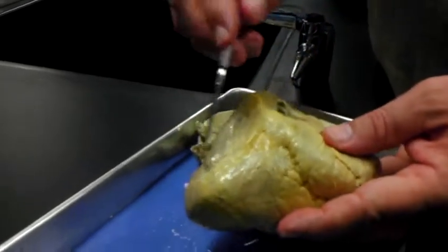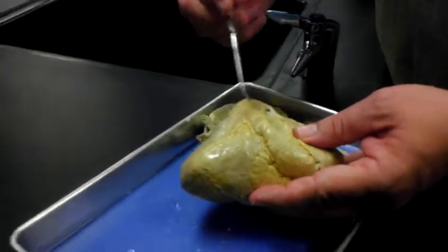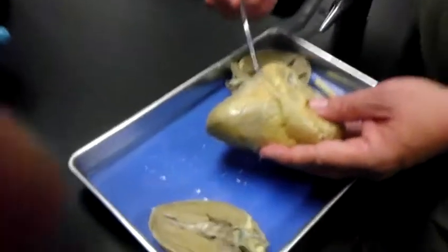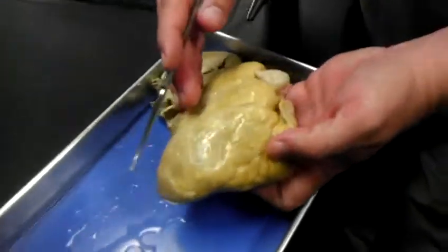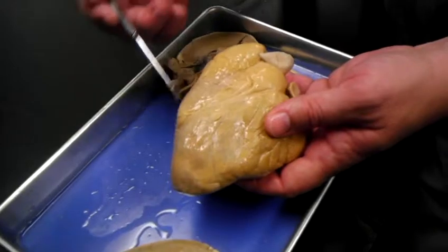Flip around to the back side. It makes this kind of T. So back here, again, underneath all this is where you find your coronary sinus. Now, if I look at the front, again, this is right ventricle over here.